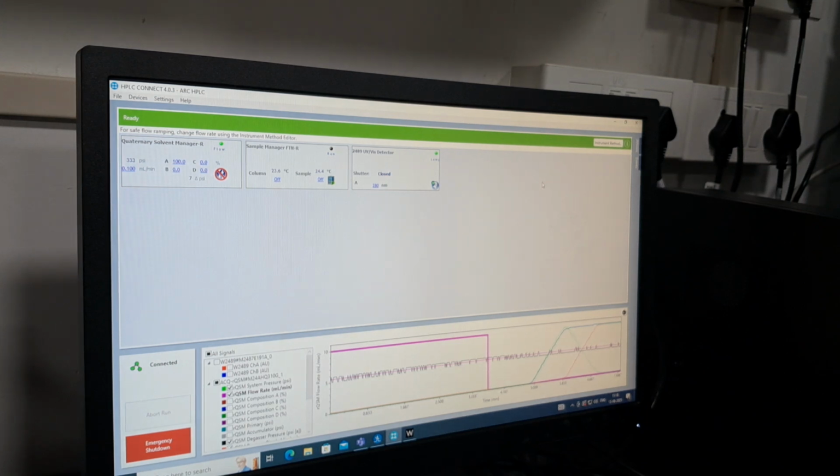See, if people are loading the samples overnight, say at 6 o'clock they are loading, and tomorrow morning they have to come and verify this, that time the instrument will be running the overnight condition. In that case it's recommended to keep it on. If they are not using it and finish their work by 5 o'clock, then they can shut it down completely, power off.